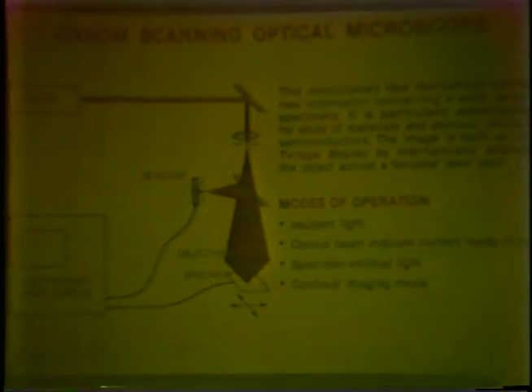Many years later, Shepherd and Wilson in Oxford and Brackenhoff and his colleagues in Amsterdam in particular, together with others, took up this work and improved it a great deal. Here is a picture taken from Shepherd and Wilson's initial attempt to go commercial, showing how you can scan the specimen past a stationary optical spot, put the returning light into a detector confocal pinhole in a reflection mode.